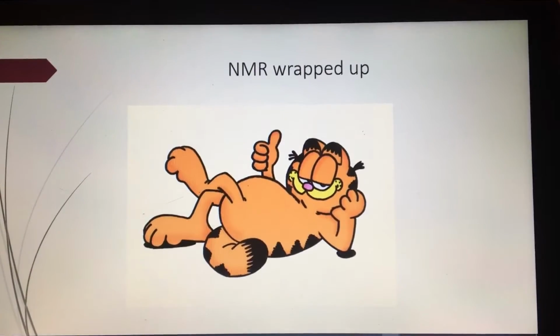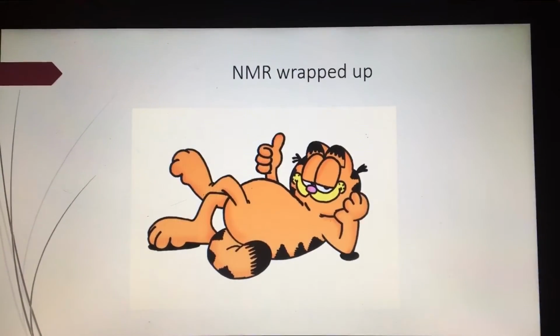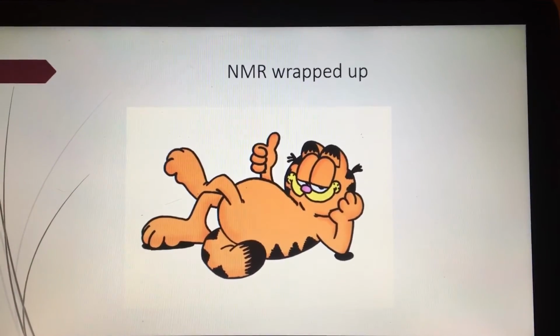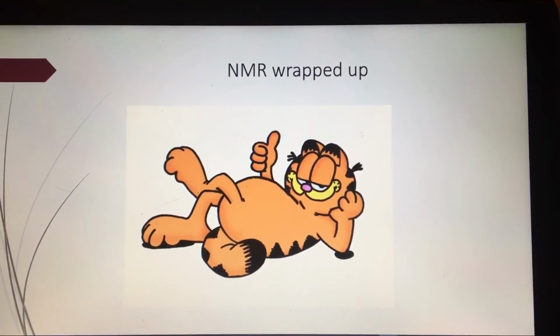From simply testing the chemical makeup of polymers and copolymers to now being able to run tests on humans through MRIs and even using a simple test to try and characterize chemical signals of endangered species. NMR is clearly a very important test with such an easy test and easy data to interpret. NMR should be the go-to test when needing to characterize an unknown material.